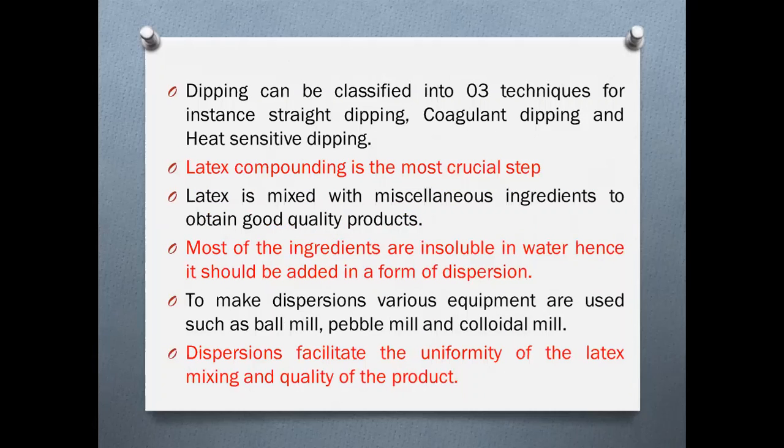This dipping technique can be classified into three groups: straight dipping, coagulant dipping, and heat sensitive dipping. In this practical, we are going to produce balloon using coagulant dipping method.